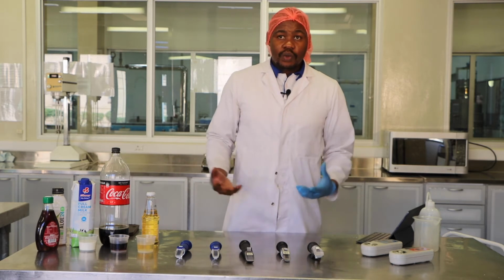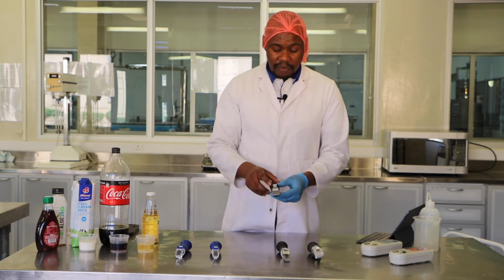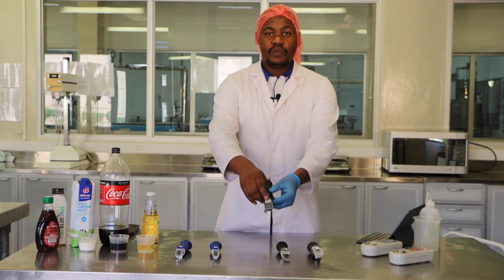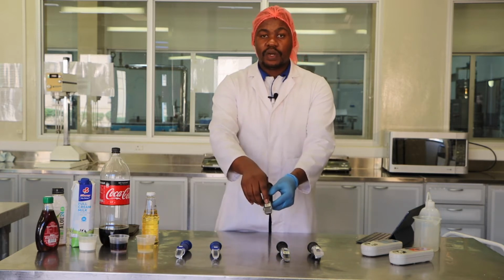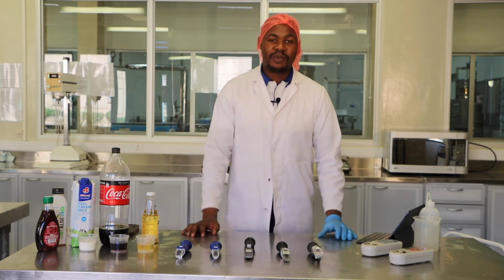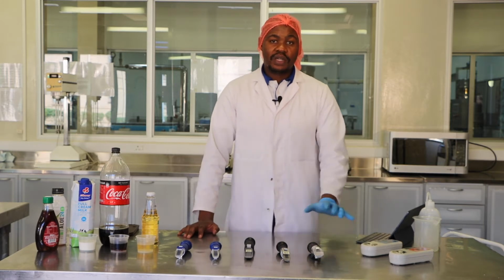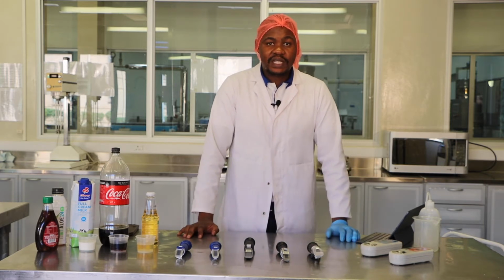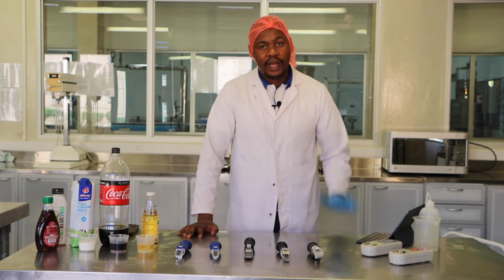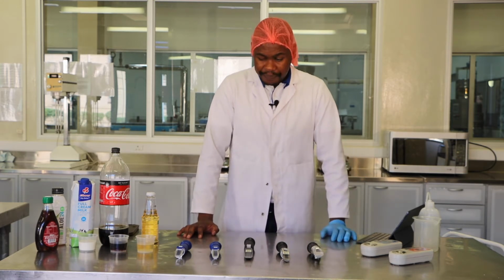What I always use to double check, for the salt refractometer, is what is written on the front part. Here we've got salt, which is 0 to 10%. So then I know that this refractometer is measuring the concentration of salt. Salt is always measured in percentage when it comes to a refractometer, and sugar is always degree Brix.